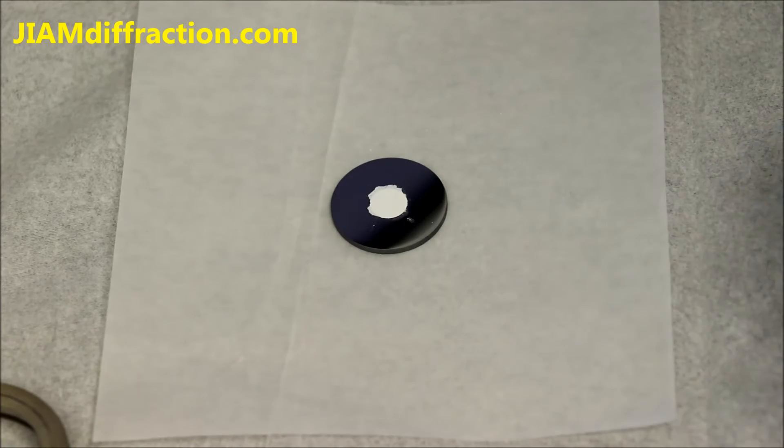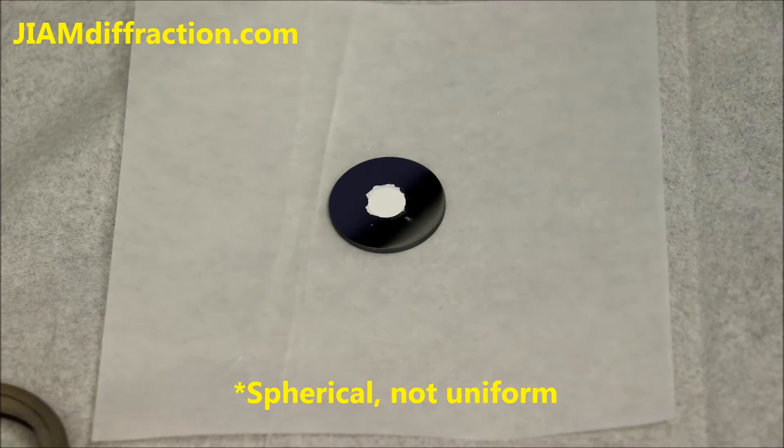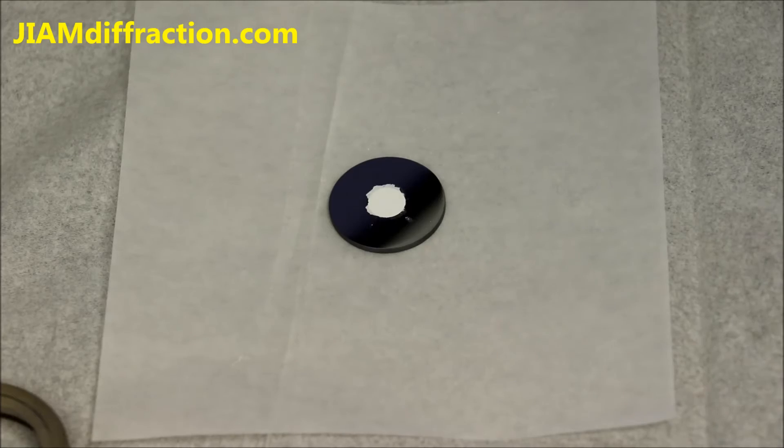This works best if your sample has particles that are more uniform in shape. If it's something like a plate then pressing down does cause preferred orientation which can affect your phase identification, but it should be fine for this sample.